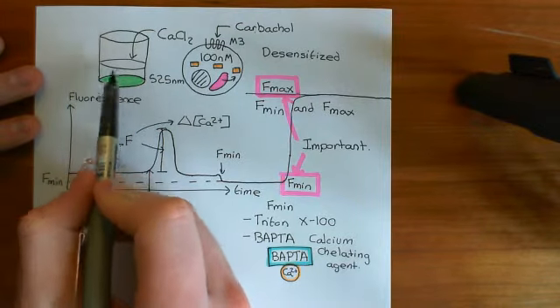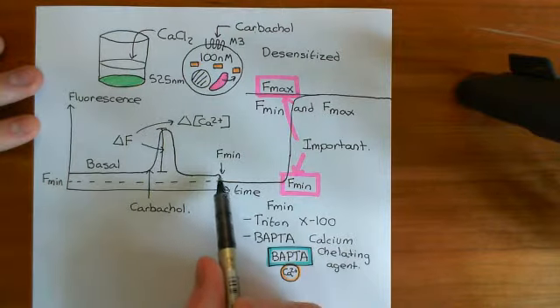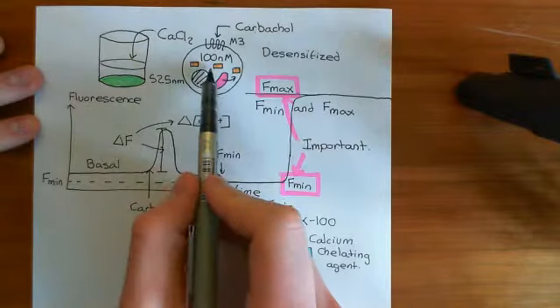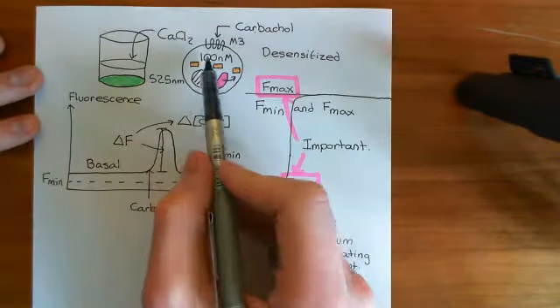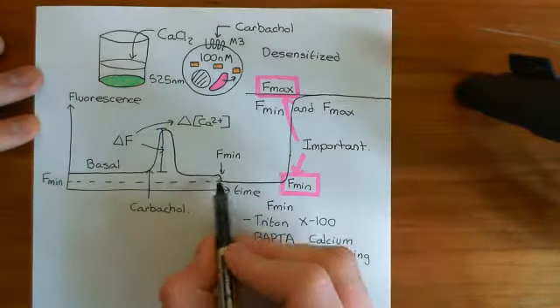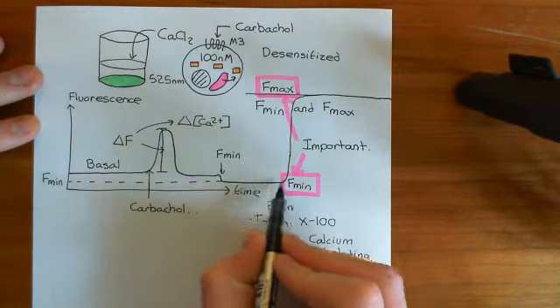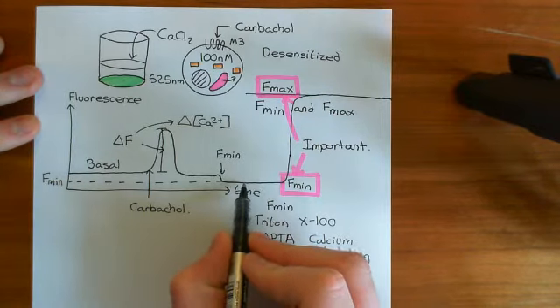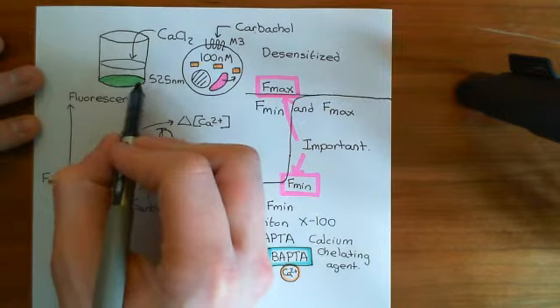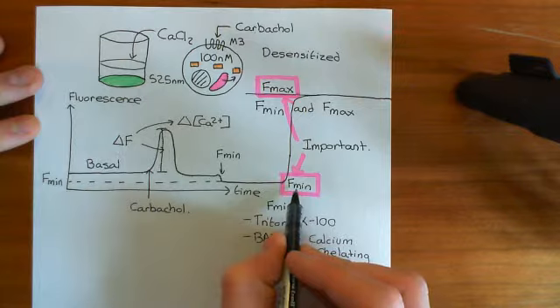So when we continue to stimulate with blue light, we're going to get very little green light coming off, even lower than we had before when the Fluo-4 molecules were in the cytoplasm, because at least in the cytoplasm they had the 100 nanomolar calcium concentration, whereas now they have nothing. So this is the absolute minimum fluorescence that the number of Fluo-4 molecules that we have loaded into all of the cells on this monolayer here could actually produce.